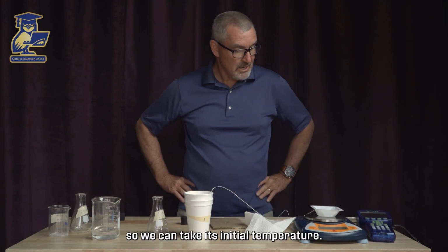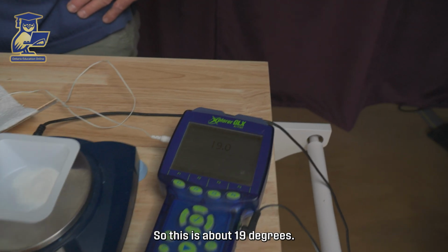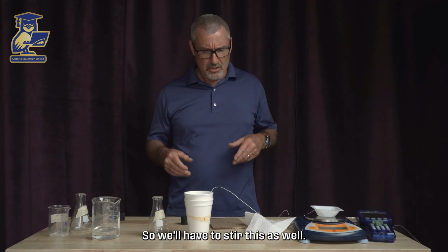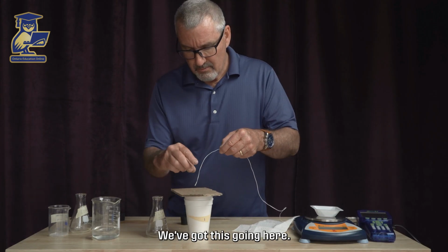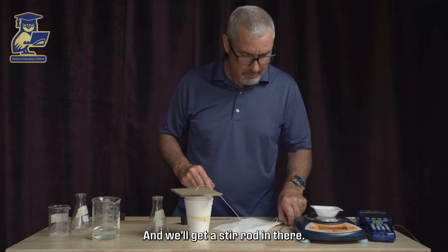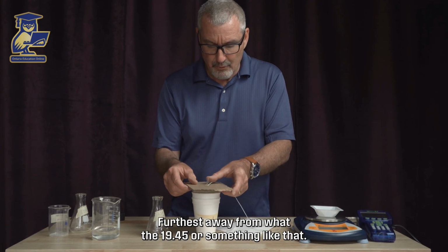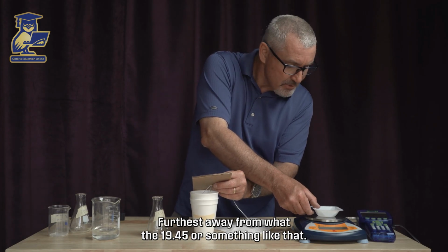So we can take its initial temperature. This water is a bit cooler. So this is about 19 degrees. All right, so that's about 19 degrees right now. So we're going to add in, and we're going to have to stir this as well because this is a solid. So we're at 19 degrees. We've got this going here, and we'll get our stir rod in there. And we're going to take the temperature, 19.4 or 5 or something like that.